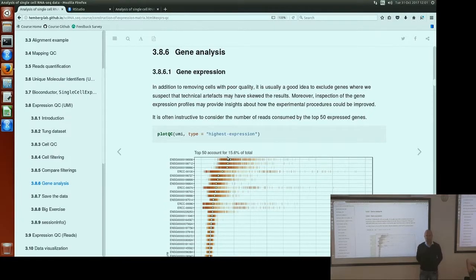So you should have the same amount of spikings in every cell. And then if something went wrong in one of the cells, then you will see this in the spikings as well. And then you can remove the cell from your experiment. So the whole purpose of spikings is they are like indicators of quality.